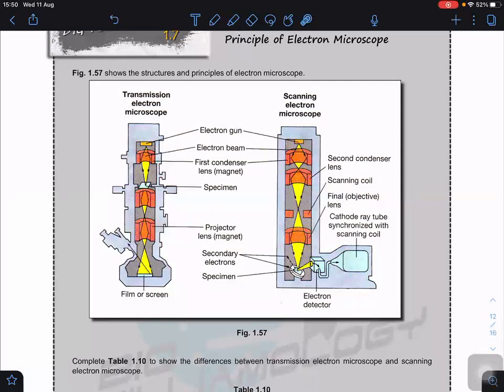Okay, so the entire operation is not something everybody can do, because you need the expertise to do it. And one electron microscope may cost you millions. The normal microscope will cost about 4,000 to 5,000. This one, a few millions. You want to buy one electron microscope, and you have to operate it in a clean room.